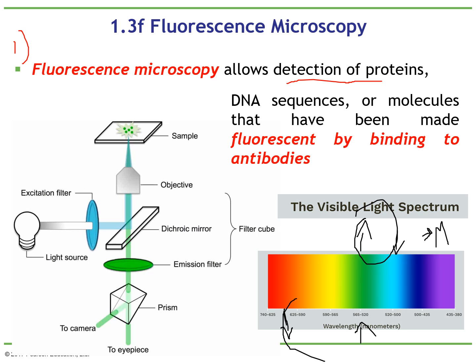And here you're able to see also the chromosomes, and you can keep adding more and more proteins. So remember, it always goes from high energy to low energy. So high energy here to low energy here, high energy here to low energy here.